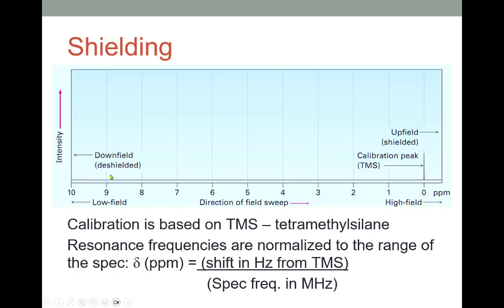high end. This is the downfield or low field region, and we would say that nuclei that create signals in this area are more de-shielded. They're closer to electronegative atoms. They have electron density pulled away from them, and so we end up with the signals moving from one side to the other. So we will see tables, just like we did for carbon NMR, that show us generalities of where we can expect protons to display signals on this kind of a chart.